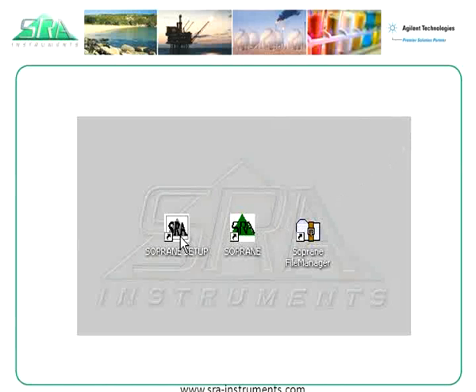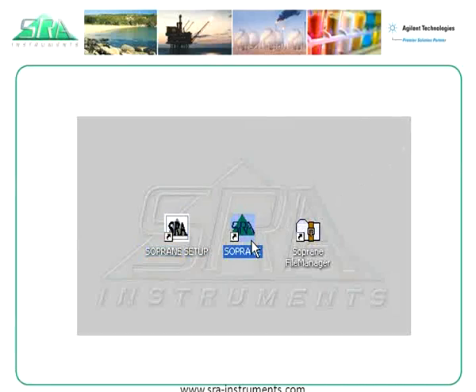Sopran setup module, Sopran main module, Sopran file manager.